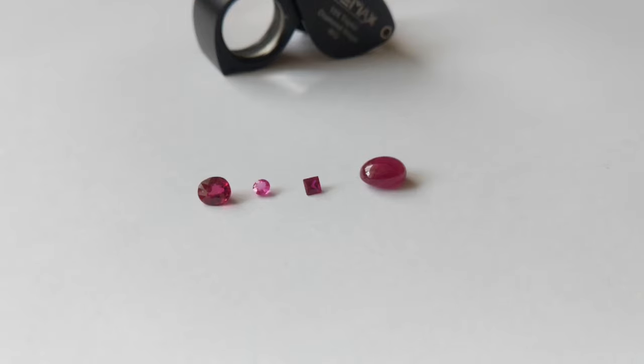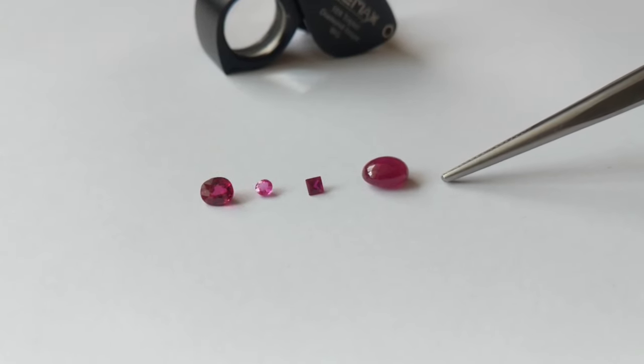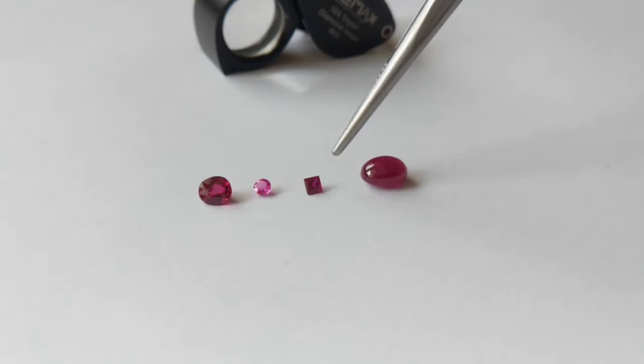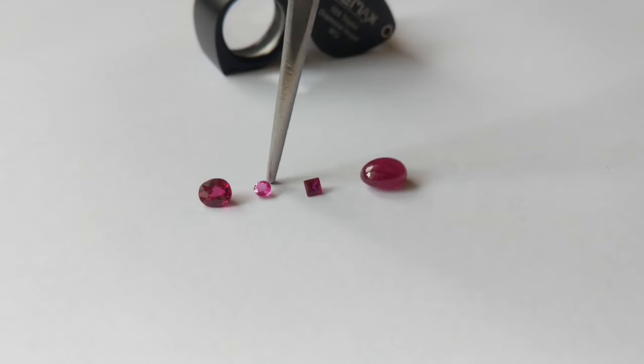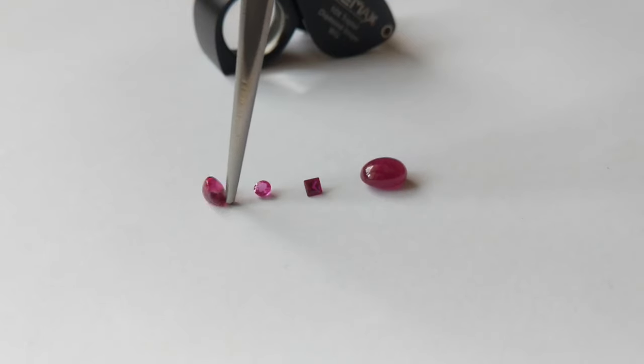All right so let's tell you the answer. So this one is actually synthetic, this one's also synthetic, this one's also synthetic, and this is actually the natural unheated pigeon blood ruby.